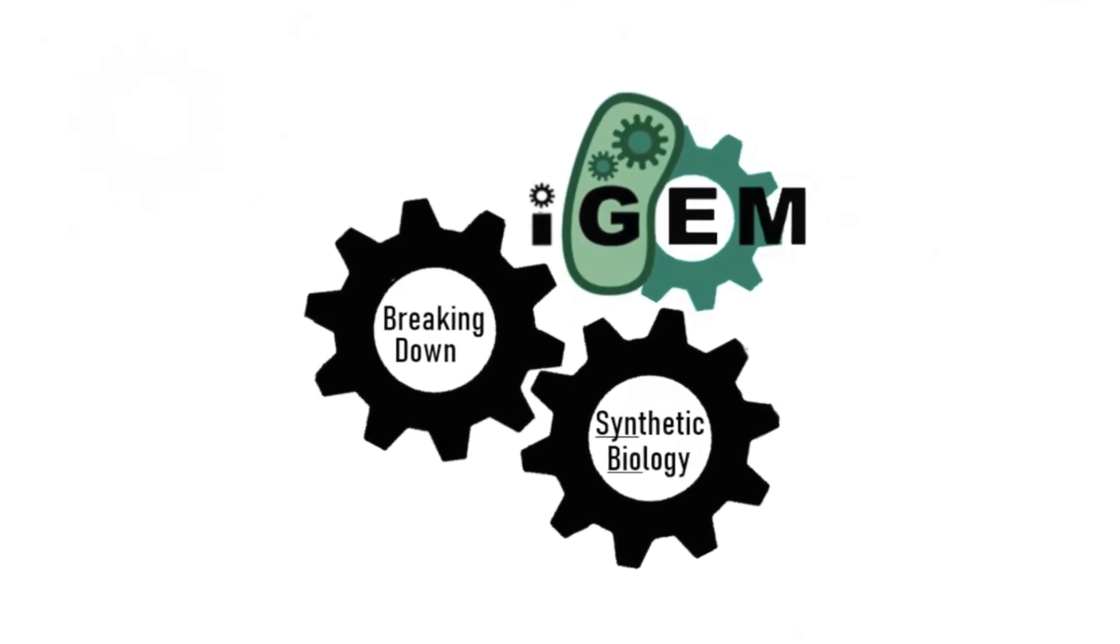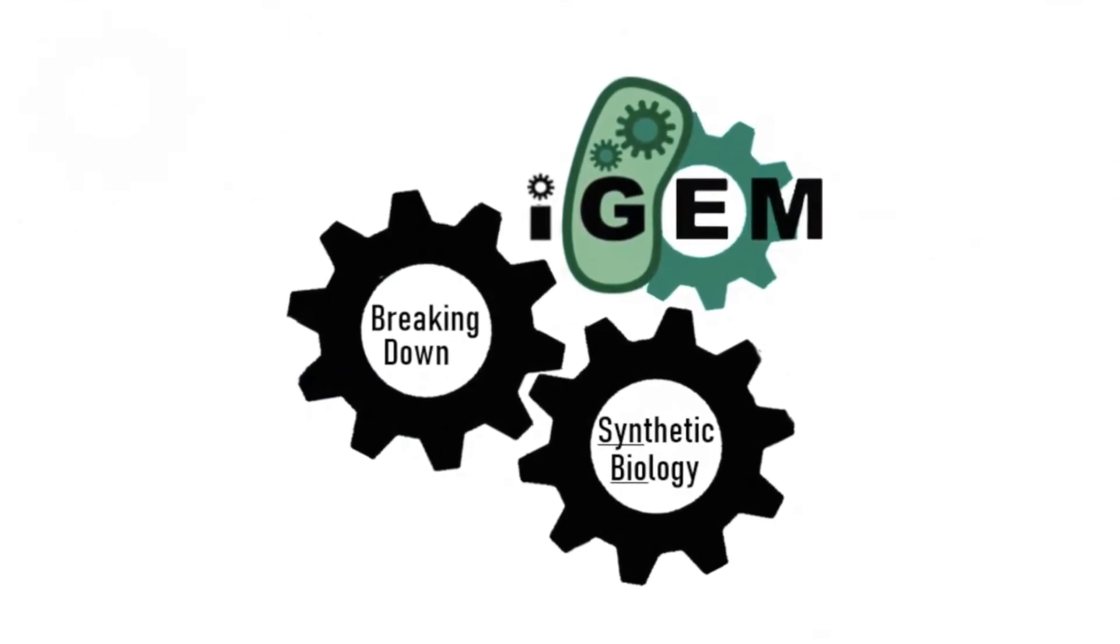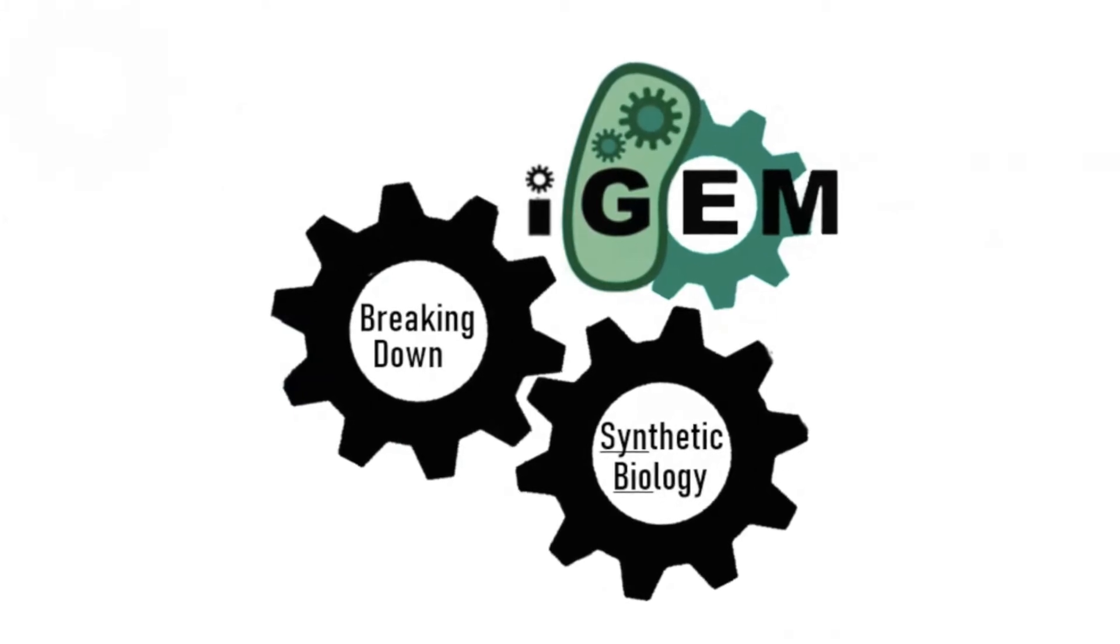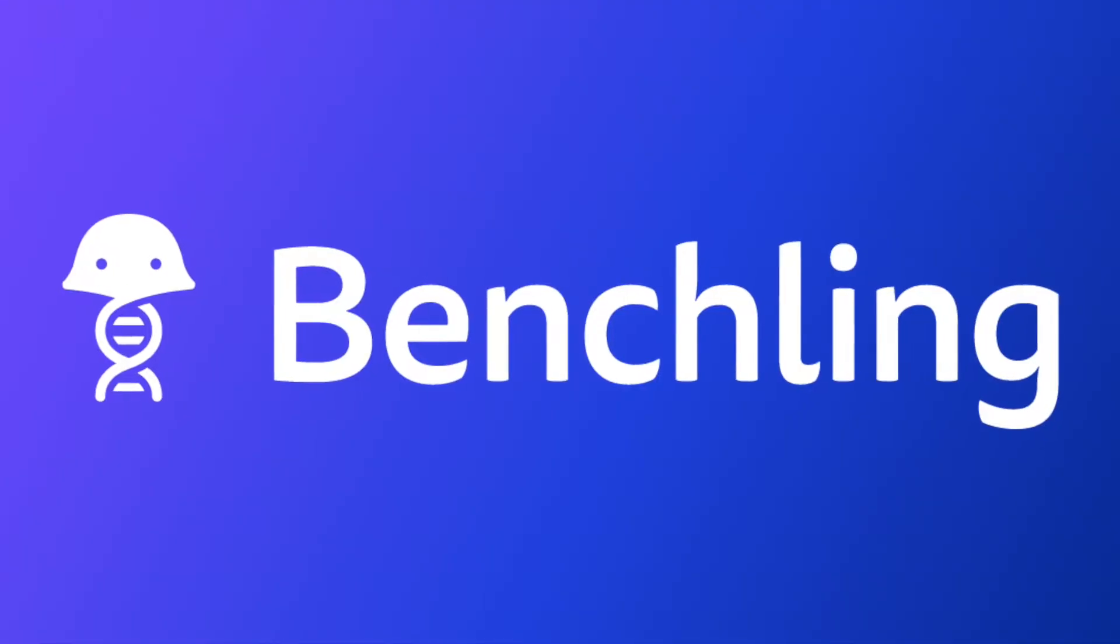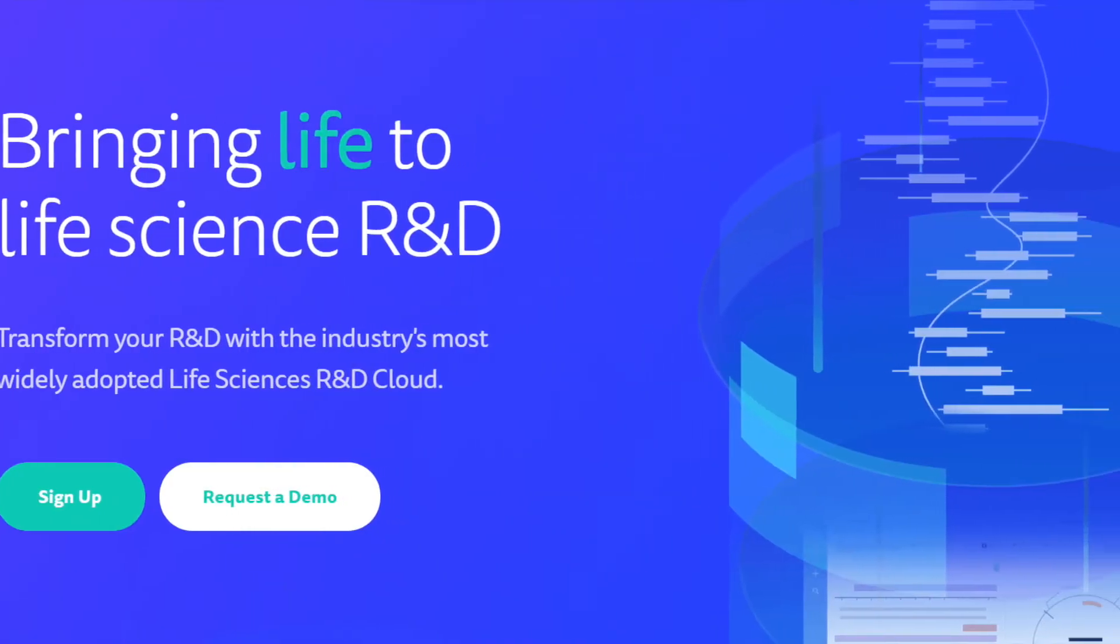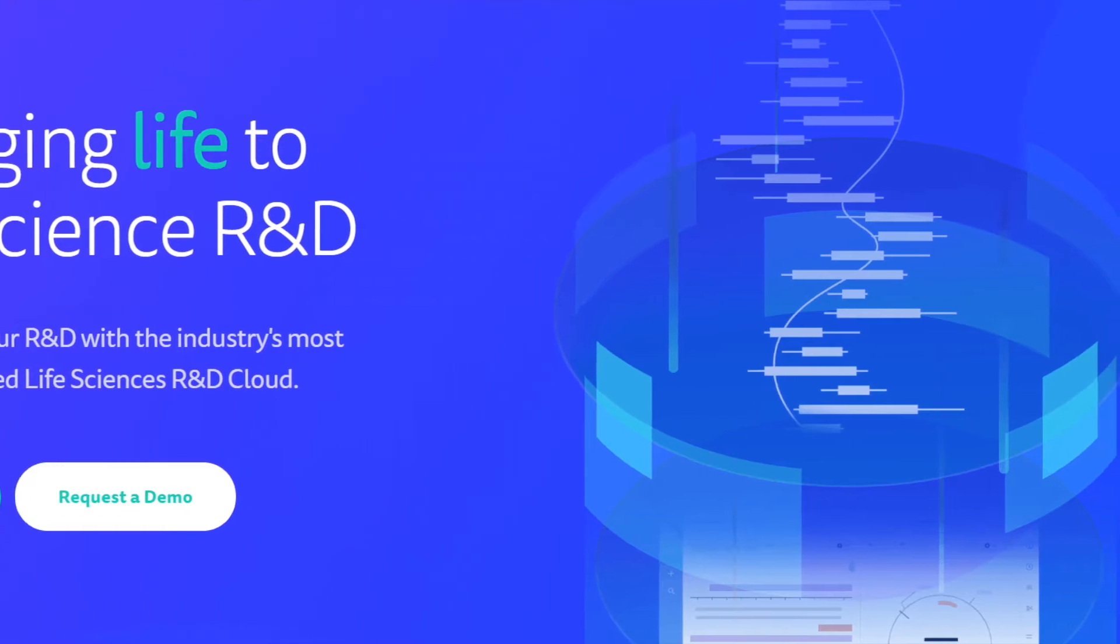Hi everyone! My name is Haley and welcome to the iGEM Breaking Down Synthetic Biology Crash Course. Today we will be talking about how to use Benchling to simulate a restriction enzyme digest.